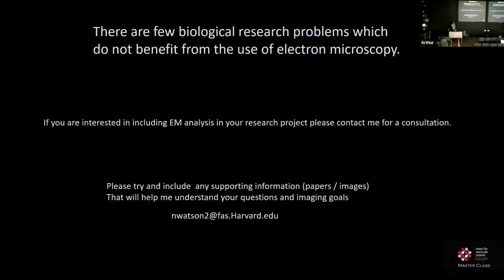You want to know what perfect looks like in your lab, in your incubator, in your hands. All right, so I'd also like to add a plug: bio-EM is sometimes falling out of fashion, especially with cryo taking over, but there are few biological research problems which do not benefit from the use of some electron microscopy. If you're doing cell biology, you should be doing electron microscopy.